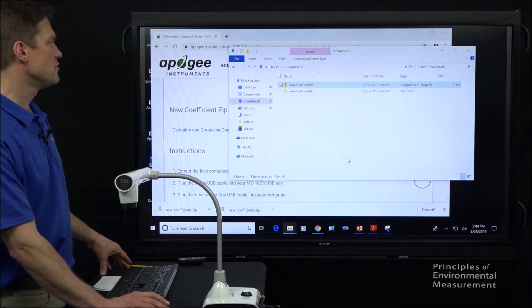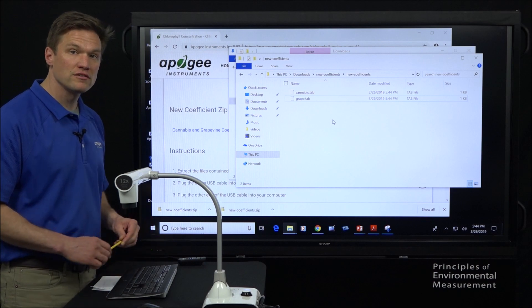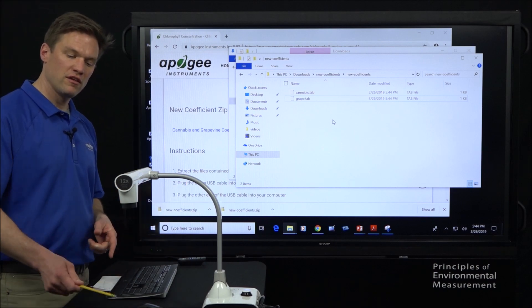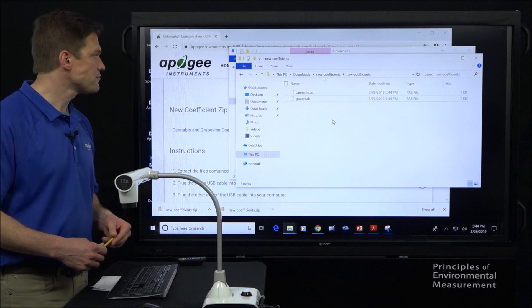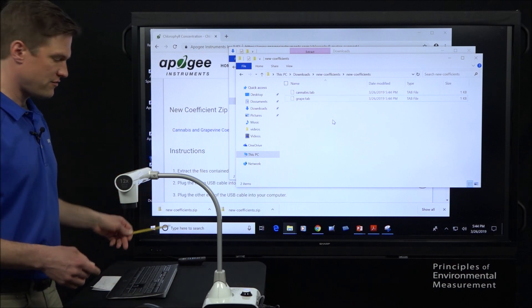Extract them because it's a zip folder so we extract them. Now, we can see we have two files in here. They're .tab files, some kind of encrypted file format that works well on the MC100 meter. And all we're going to do is we're going to connect this and drag these files over.